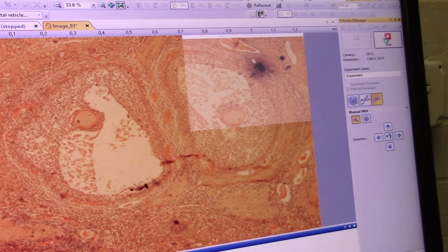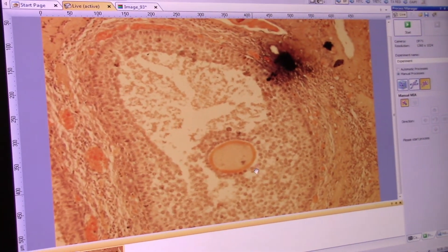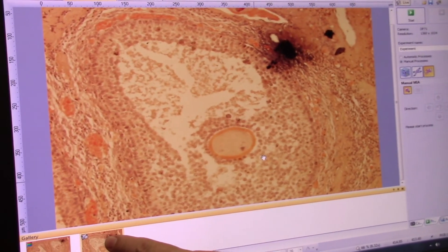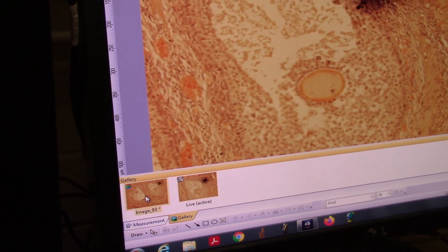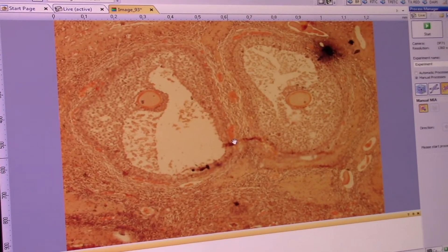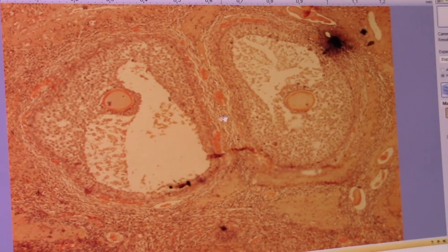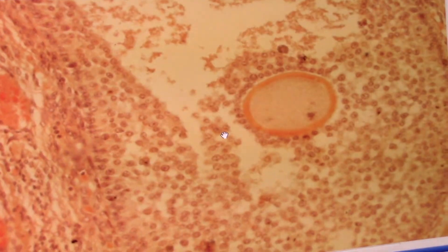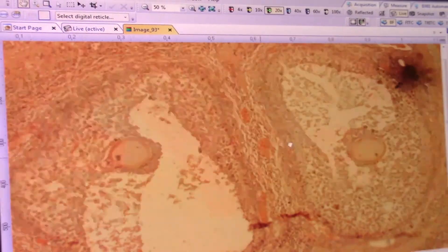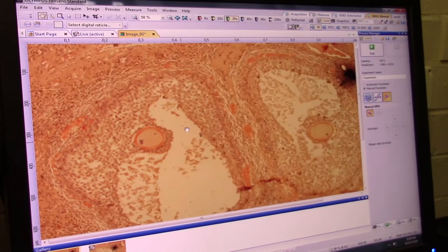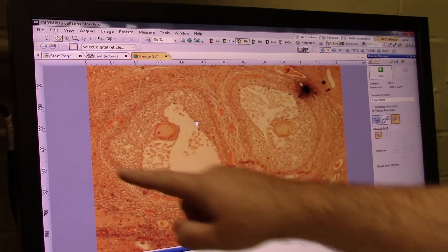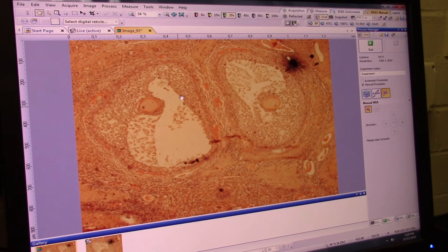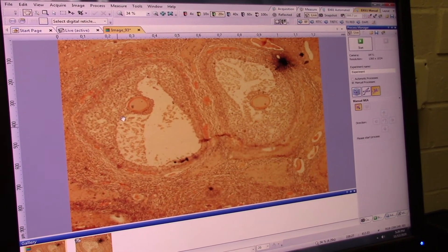This is called stitching. I'll stop my process, and there's a beautiful image of all four. Let's click on the image. Isn't it better if I zoom in more? So let's zoom in as much as we want with the computer — I can compare this cell to this cell, all in the same image. Here's the whole image I just saved: 20x right here, 20x right here, 20x right here, 20x right here. But now I see a broader field of view. This is called stitching.